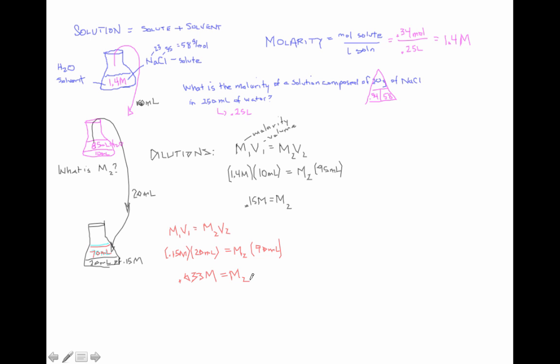And so what I challenge you with in this lab is, can you get all the way down to 0.000001 molar? That's a part per million. And can you get down that low? Sometimes chemists need to reach those low levels of detection.